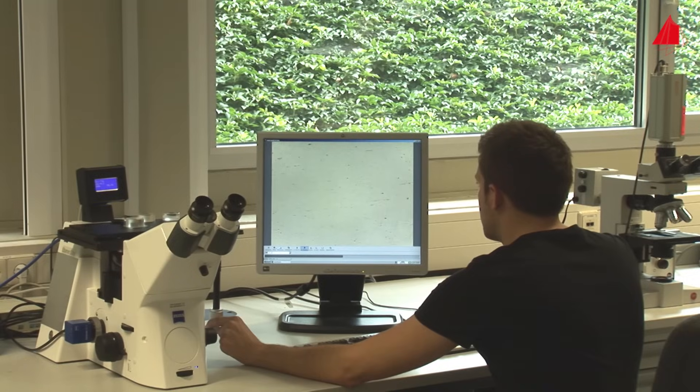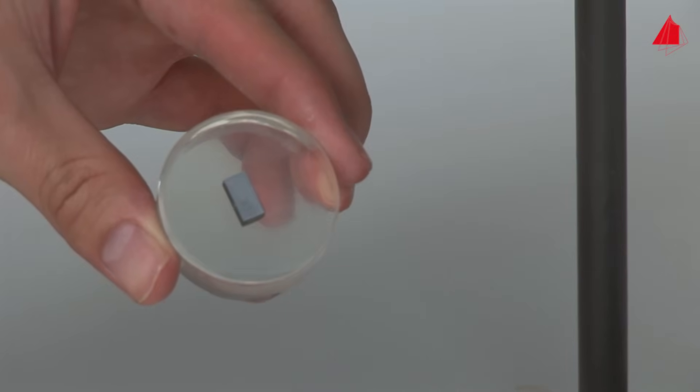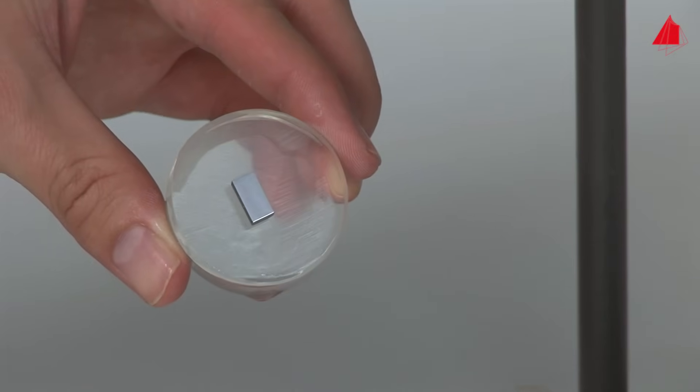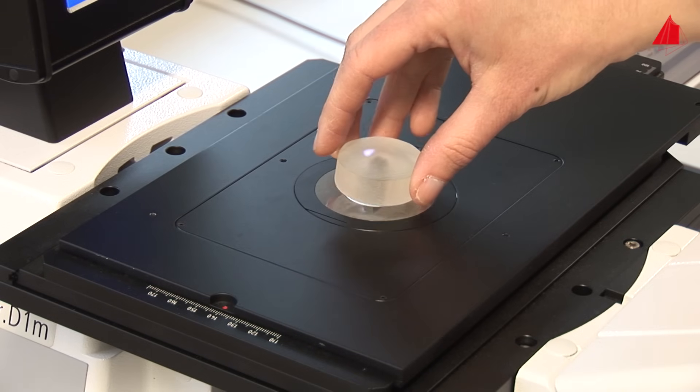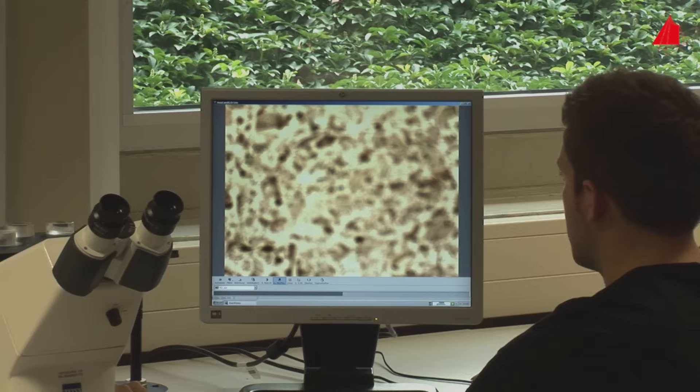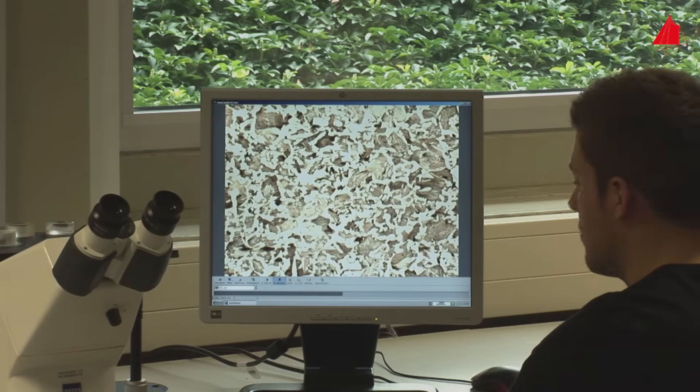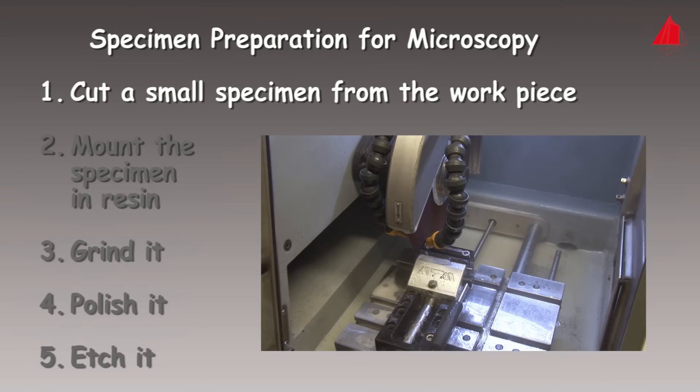In this video, we would like to introduce the microscopic techniques of metallography. Microscopic means to investigate a workpiece at higher magnification, usually with a light microscope. To have a look at the inside, the material has to be prepared properly and this is how it is done.